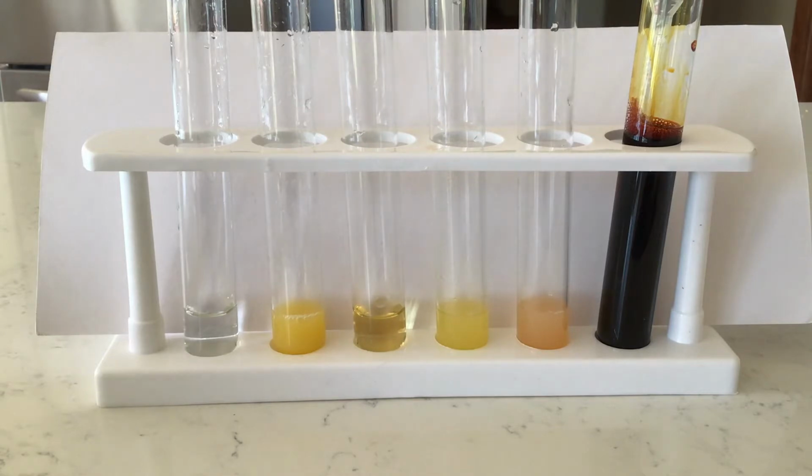Once that occurs, I'm going to have what's called an endpoint, and the iodine is actually going to change the color of the solution. That's going to be where you want to stop counting the drops, and you're going to record that number. Now please be careful, because I'm not going to stop adding drops at the endpoint. That's something I want you to observe and determine on your own. So make sure as you are watching this, you pay attention, count the drops, and then look for that endpoint where the color of the solution changes.